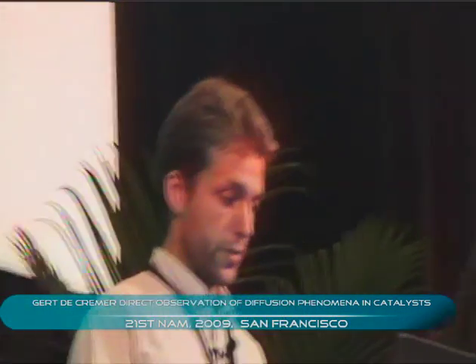In principle, optical techniques are limited by the laws of diffraction, meaning that we have a resolution for optical light of a few hundred nanometers. But there are tricks, especially if you're looking at individual molecules, to obtain a better accuracy and a better resolution, even in the nanometer regime. That I will show you in the second example. All this can be done with a fairly good time resolution. We can follow dynamics at the millisecond scale. And we can operate it under in situ and mild conditions, contrary to electron microscopy, for instance.